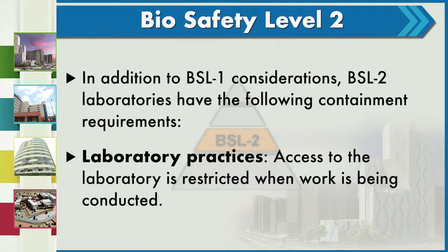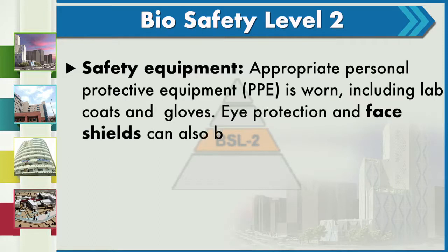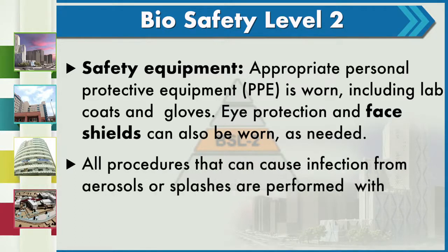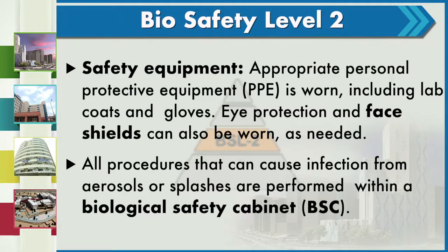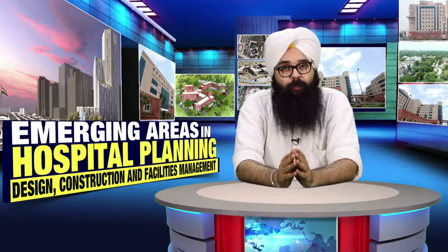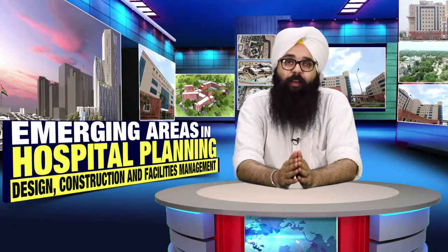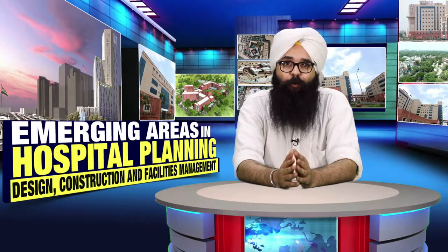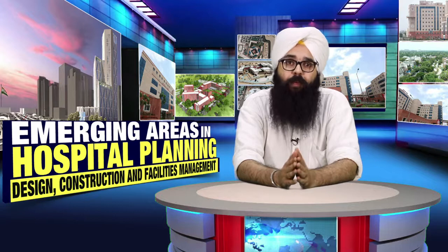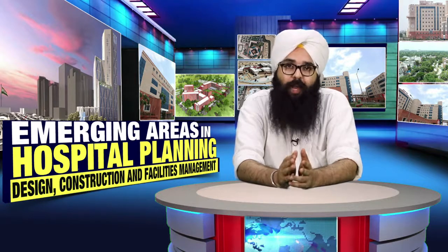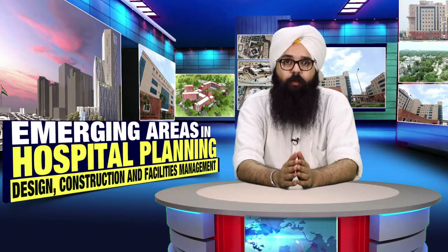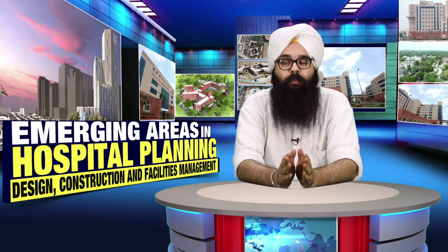Access control is very important in BSL 2. Appropriate personal protective measures are provided including lab coats, eye protection, and face shields, and all procedures are done in a BSC — a biological safety cabinet. A BSC is a cabinet where the air is controlled so that air inside the BSC does not reach the laboratorian. There is no aerosol or splash from the specimen reaching the person working at the BSC.